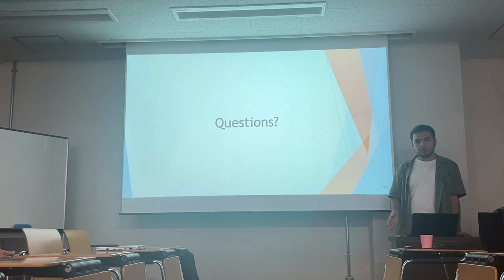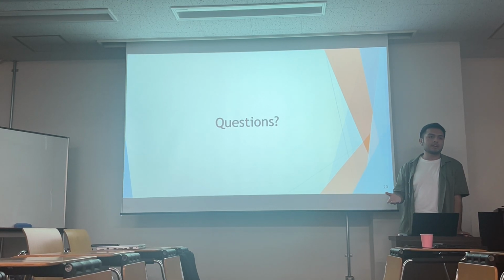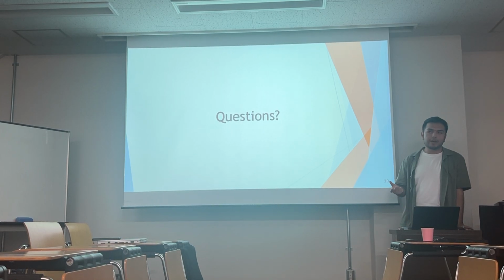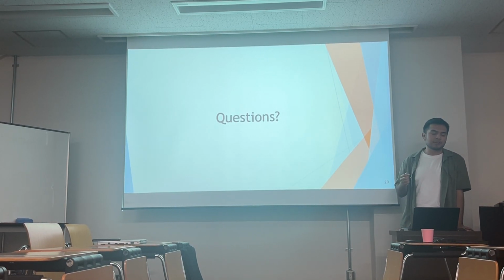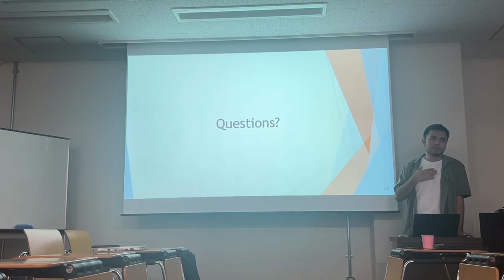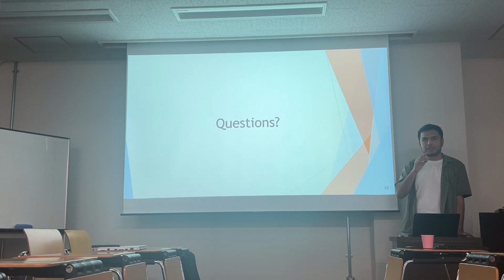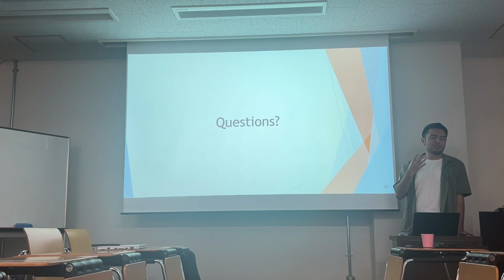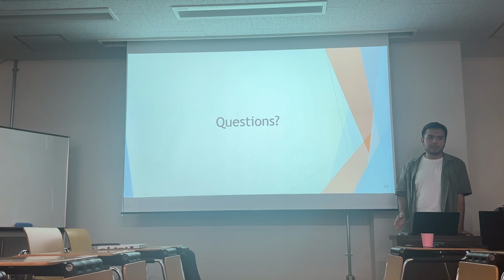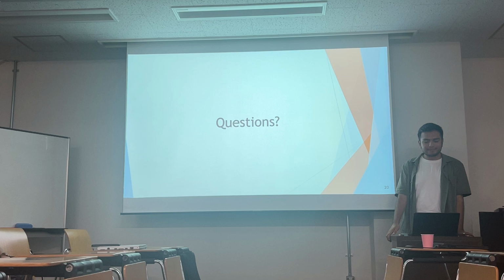So accurately measuring exosomes can tell us a lot about where they come from. If we know a cancerous exosome is, let's say, 30 nanometers large, and we find a bodily fluid that has exosomes 30 nanometers large from this specific part of the body, that can give us a hint that maybe these are cancerous exosomes. The EX400 can also measure a particle's electrophoretic motion, which is a very large word, which is another useful parameter when trying to figure out more properties about that particle. So in short, getting accurate readings on exosomes can tell us more about where they come from. Thank you.